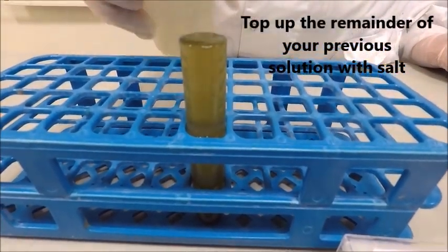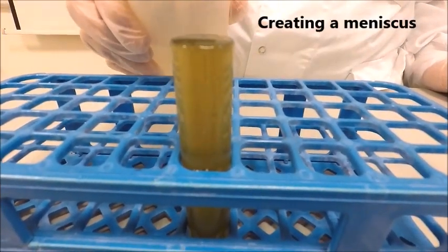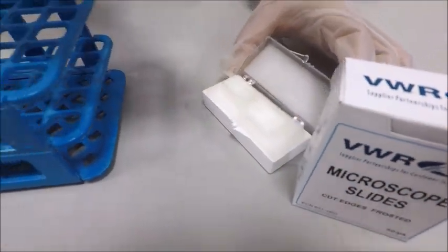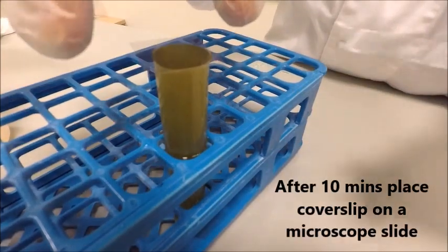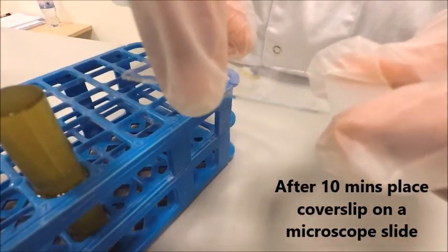Creating a meniscus, place your cover slip on top of this meniscus and allow the eggs to float to the top of the tube and stick to the cover slip. After 10 to 15 minutes, place the coverslip on a slide and examine using your 4x and 10x lenses under your microscope.